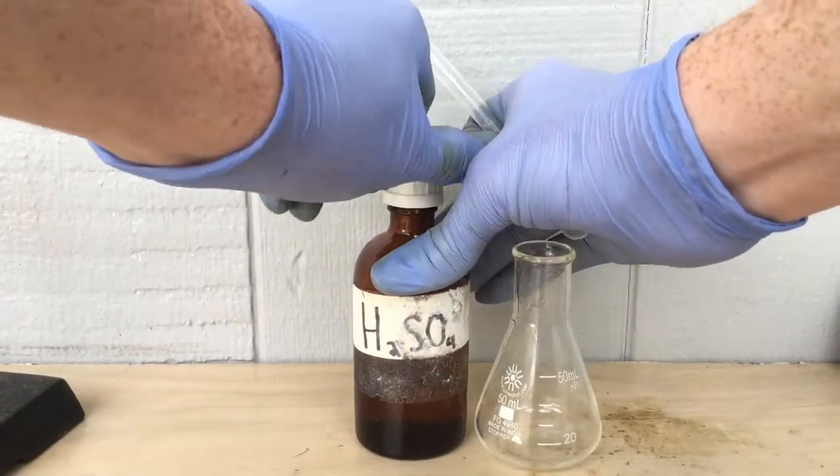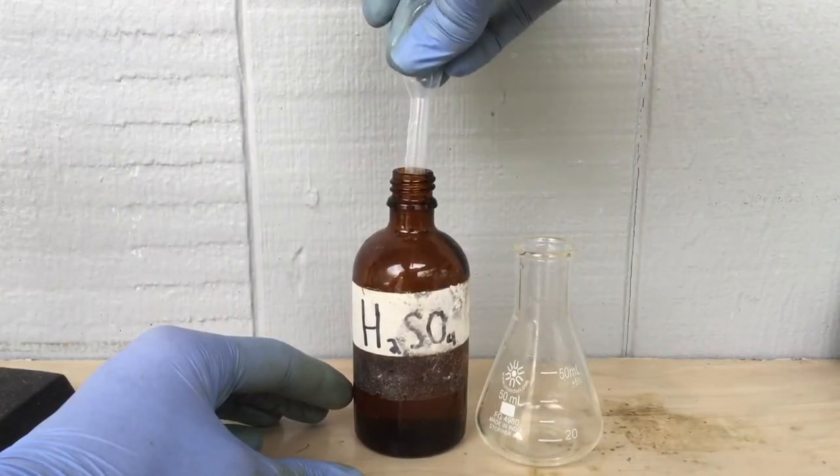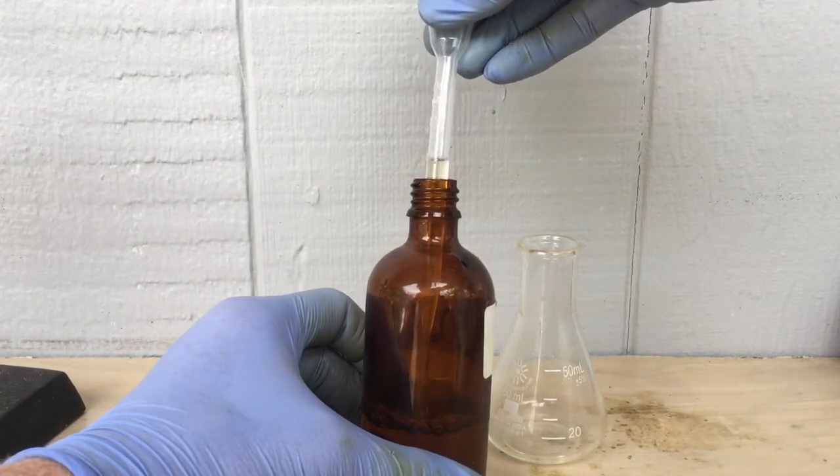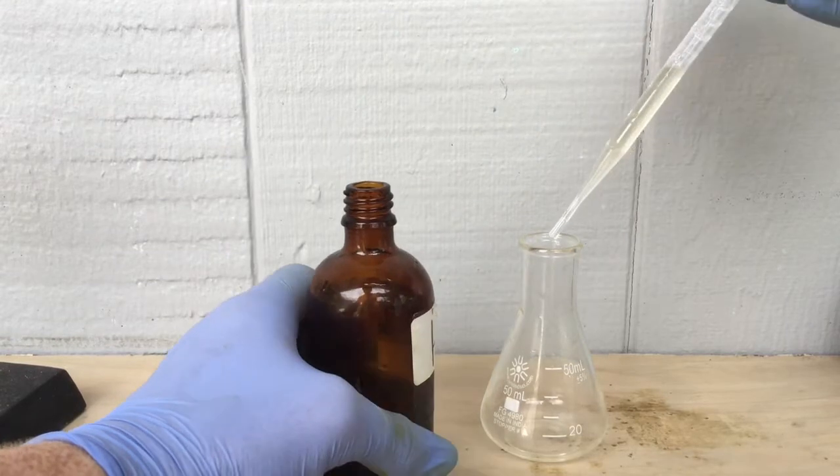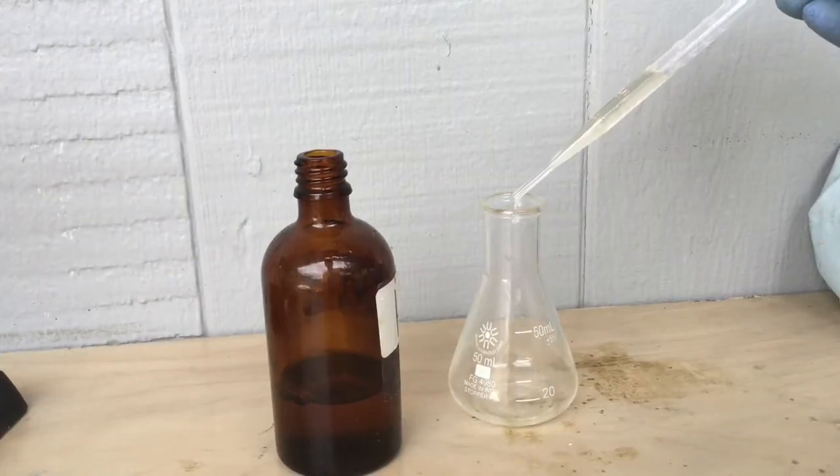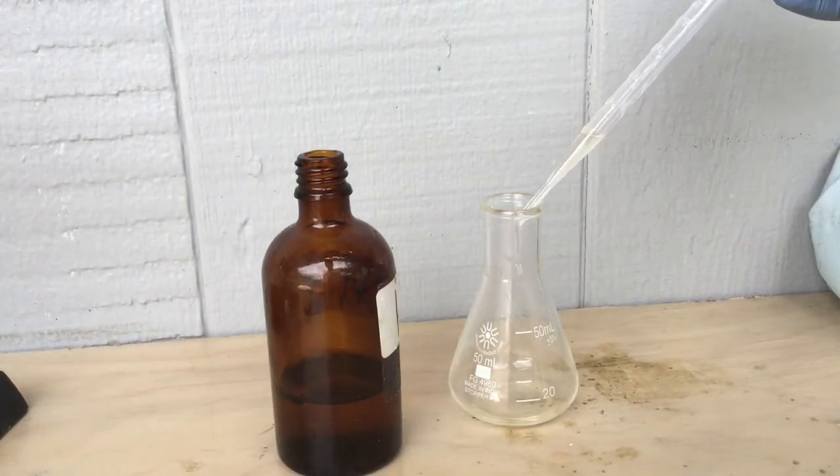Right here is my sulfuric acid of unknown concentration, so I'm just going to take around two milliliters of the acid and put it into my flask. This is known as the analyte, and this is what we're going to be analyzing the concentration of.